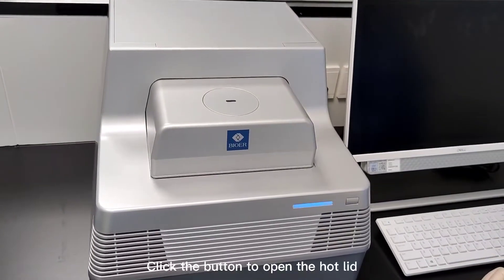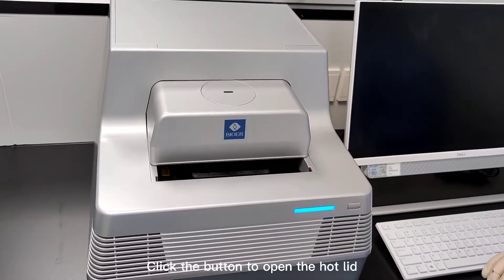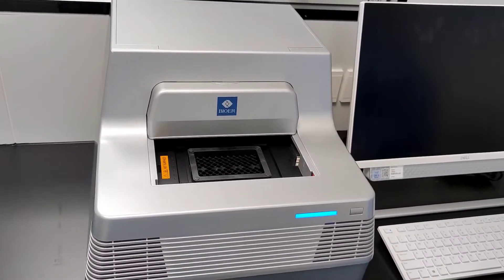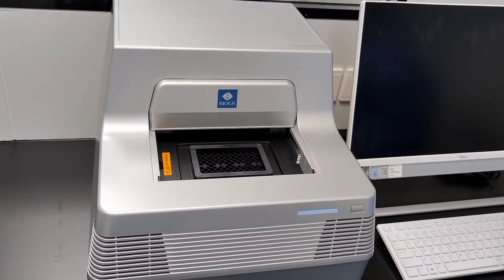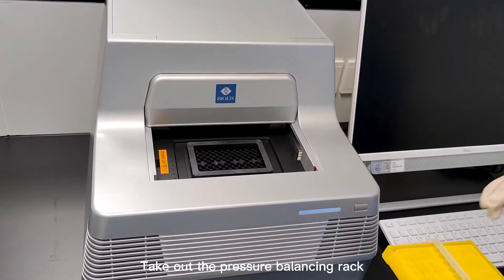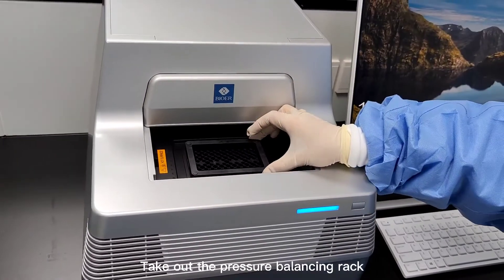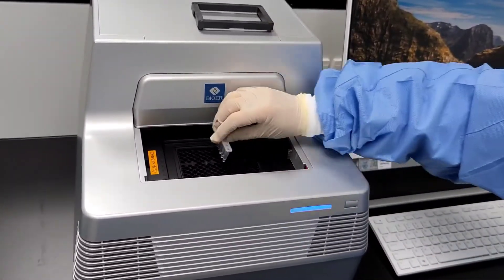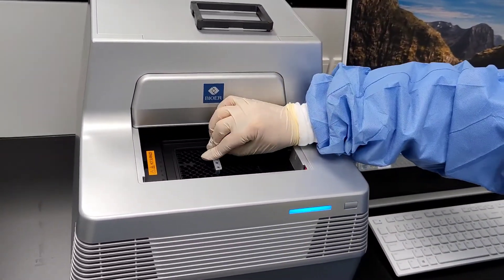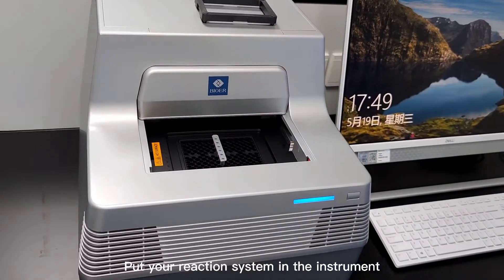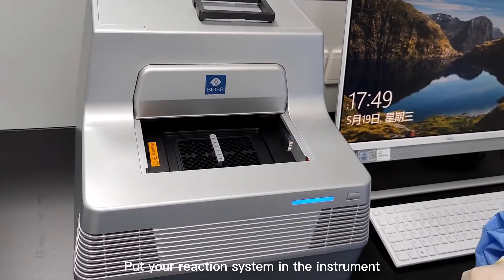Click the button to open the hot lid. Take out the pressure balancing rack. Put your reaction system in the instrument.